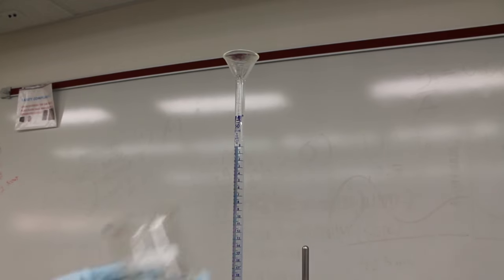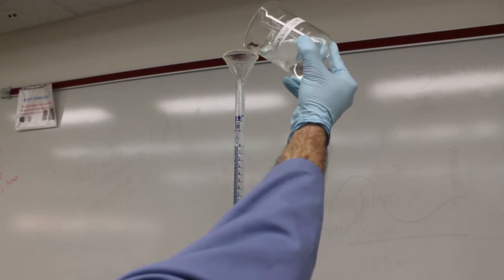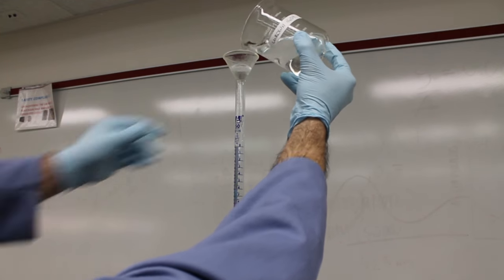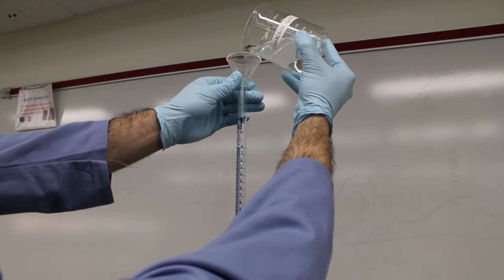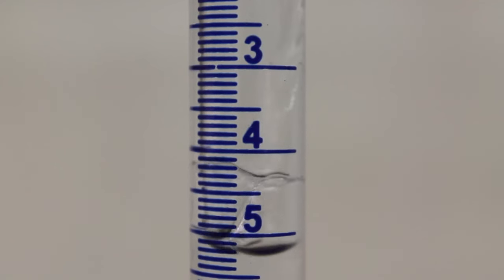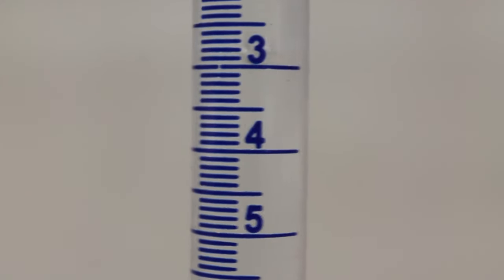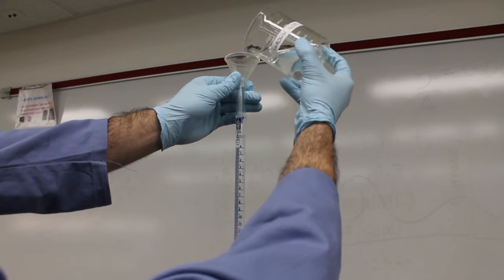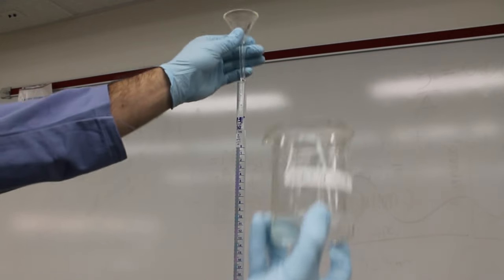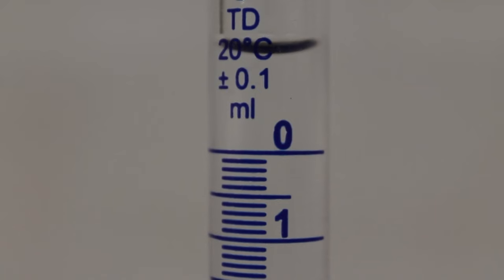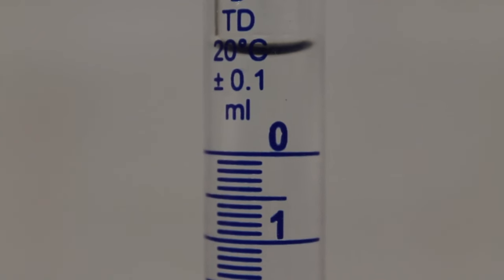Once you are fully rinsed, you can top off your burette with your titrant. Then you'll need to zero out your burette to get ready for your titrations. Remember, your initial reading does not have to be zero, but will need to be documented for your future calculations.